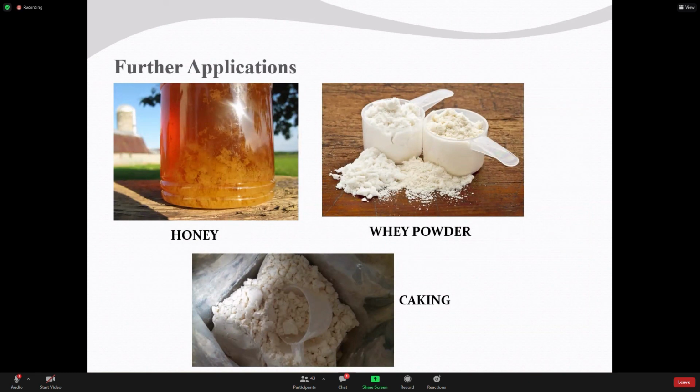So this is something that we are still currently working on, and this crystallinity and amorphicity approach is something that we will be focusing on in SuChAQuality in a detailed way. So for the secondments that are going to be done in resonance systems, most of the time you will try to use these sequences, solid echo, magic sandwich echo, or spin diffusion sequences, to understand this amorphous and crystalline behavior.